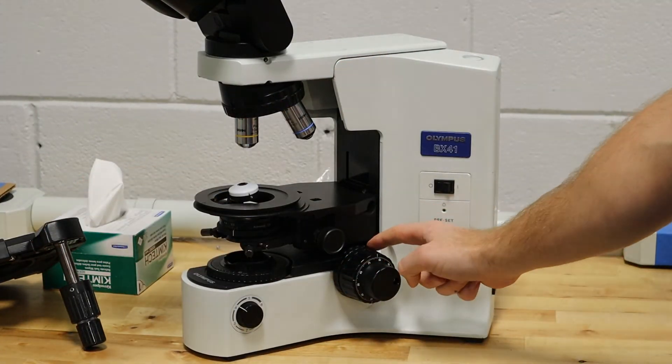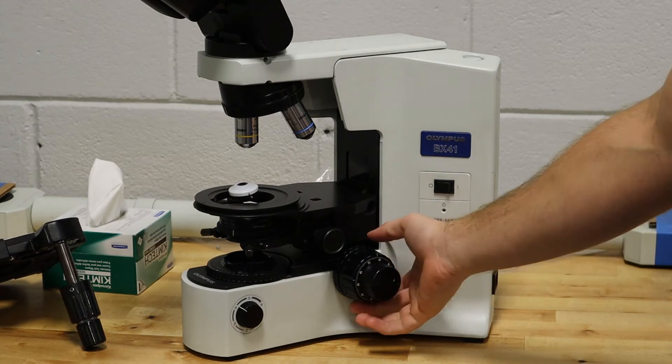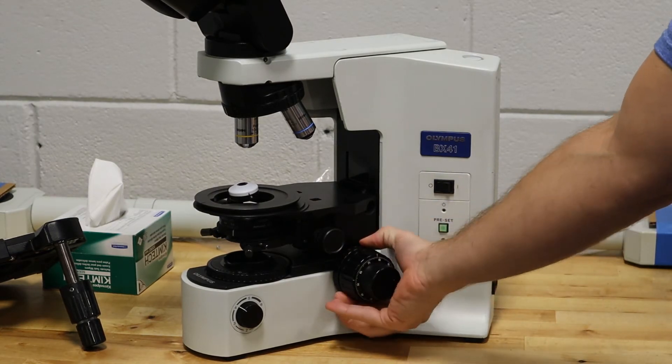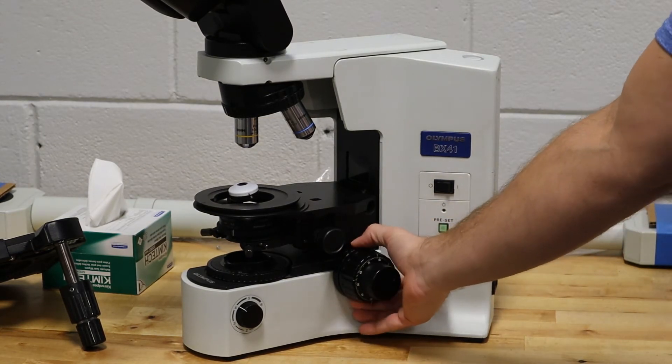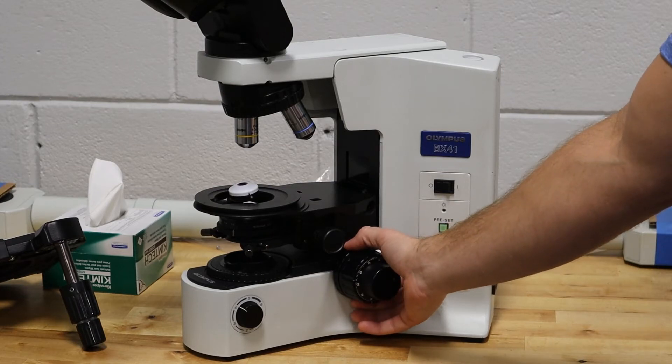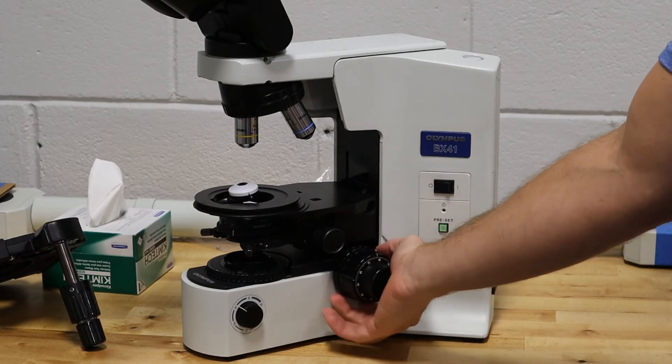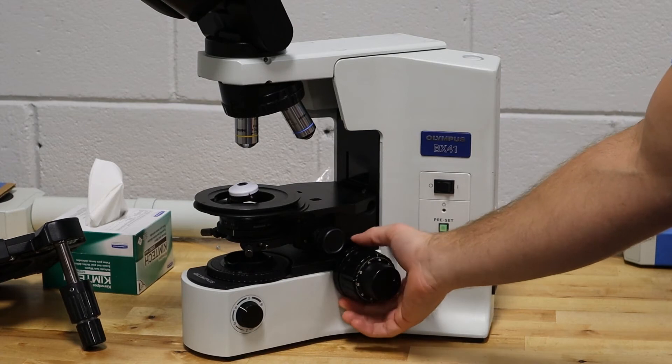This inner ring on the right side of the microscope, if you turn it to the right, it's going to increase the tension. If you back it to the left or counterclockwise, it's going to loosen the tension.